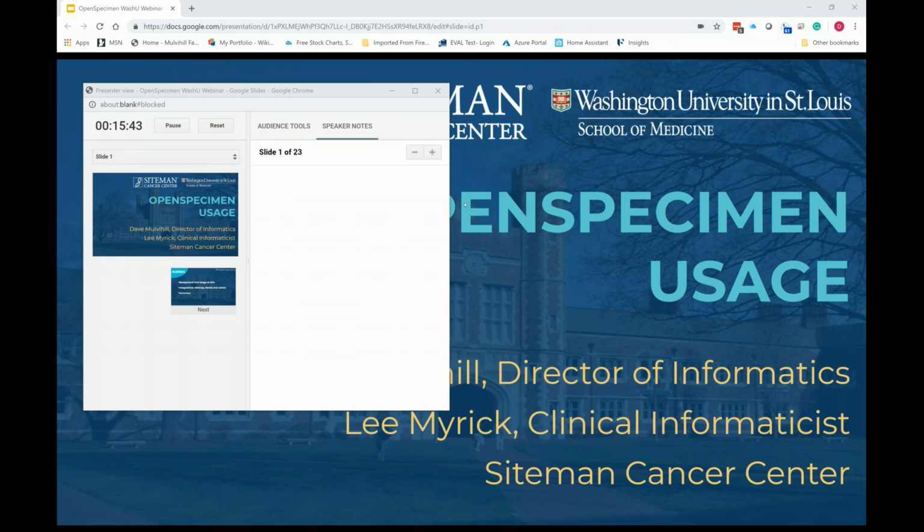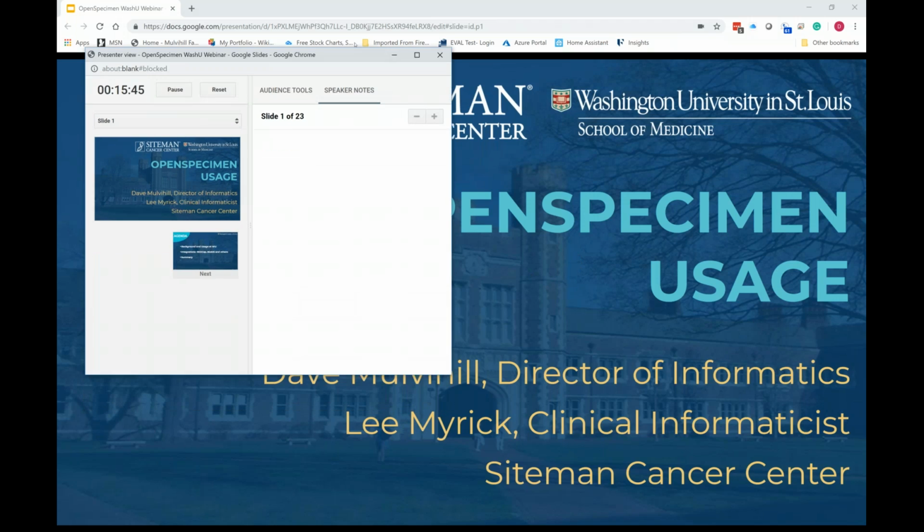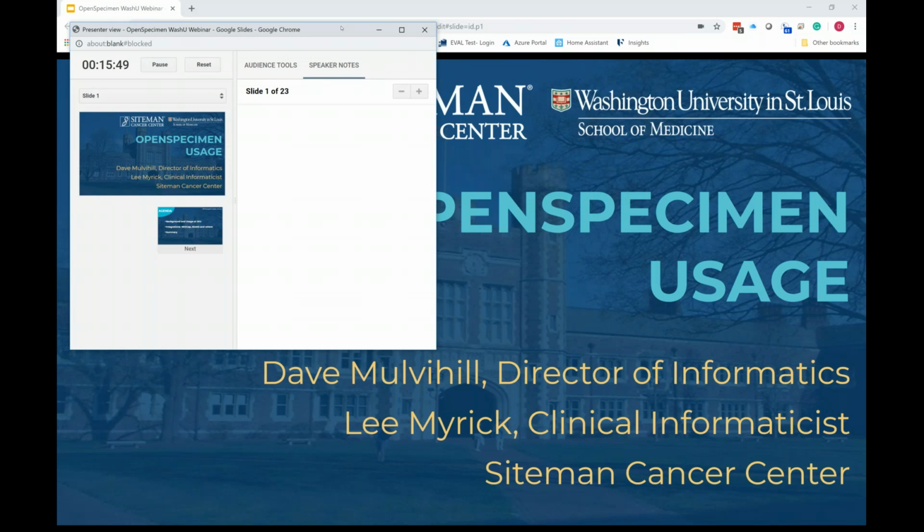Okay, perfect. So thanks for inviting me to speak about our OpenSpecimen usage at Washington University. My name is Dave Mulvihill. I'm the Director of Informatics for Siteman Cancer Center, and I'm here with Lee Myrick, who is a clinical informaticist on my team. Just a disclaimer to start with, we are not being paid to talk about OpenSpecimen. We pay them. They are a vendor of ours. We do like presenting about how it's used at our institution, because I think it's good for others in the community to understand how we use it.